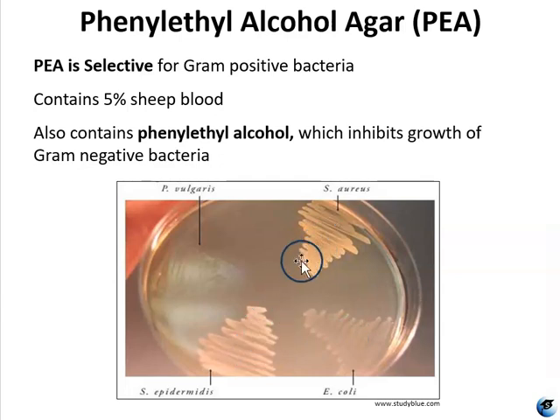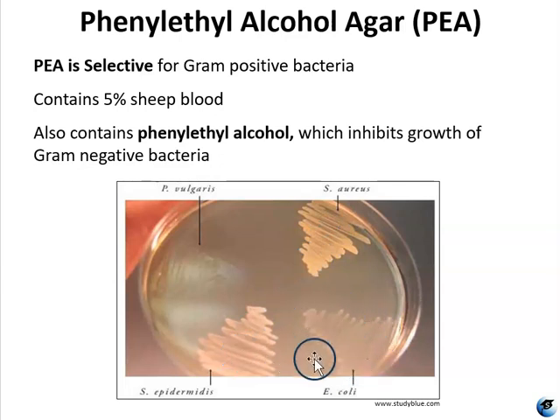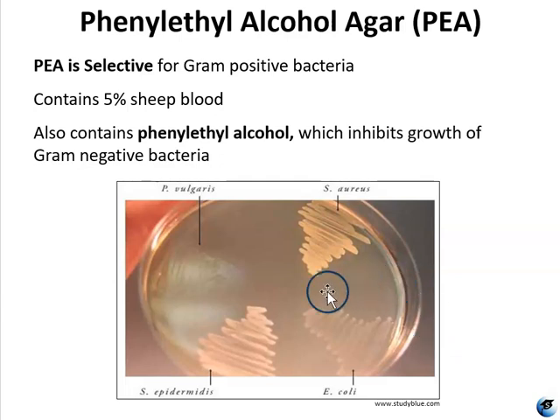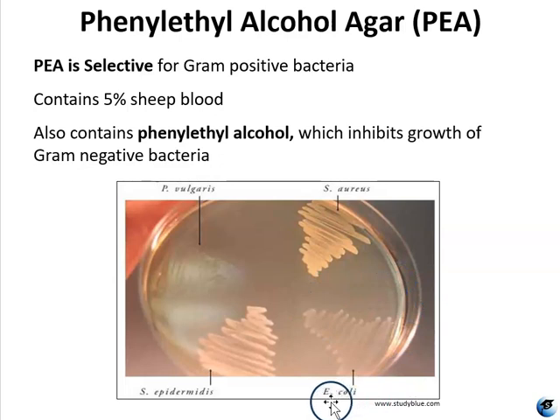On this example PEA plate, it looks like Staph aureus and Staph epidermidis have pretty good growth. E. coli is a bit more questionable — it's kind of semi-transparent, and if you're not sure whether that is considered good growth, you would want to look at E. coli on nutrient agar for comparison. Since you're in an at-home lab, it's completely okay to Google image search what it should look like. I would be suspect of this growth, especially because we know that E. coli is a gram-negative species.